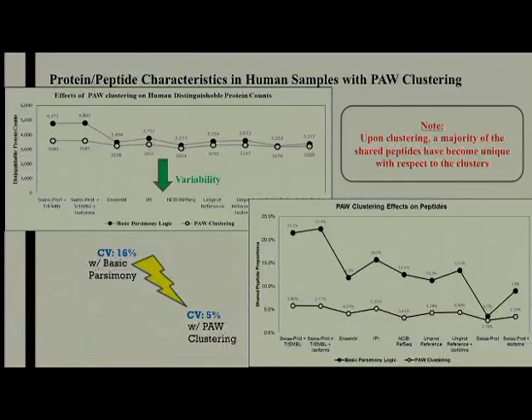What effect do you think the QIC value would have if you're doing a TMT-based experiment for quantitating proteins? The QIC, from what I read, is a label-free method. TMT would be more for... I may be wrong on this. I don't have as much experience with the TMT labeling stuff, but I would assume TMT would be more for absolute quantification, whereas this QIC is for relative quantification. Again, I might be wrong because I don't have as much experience with that part.